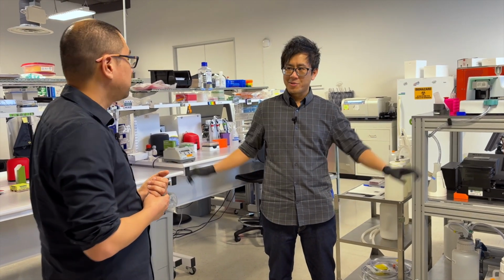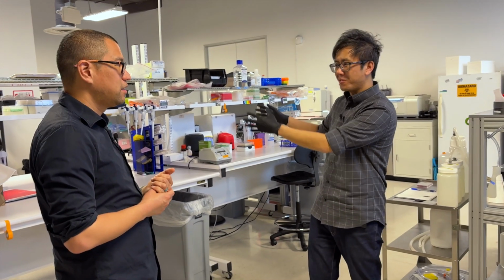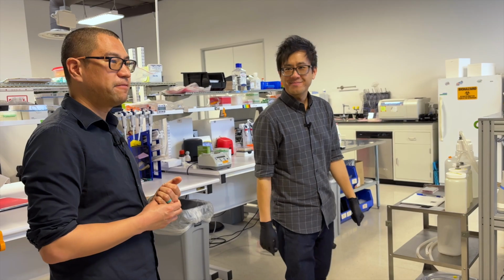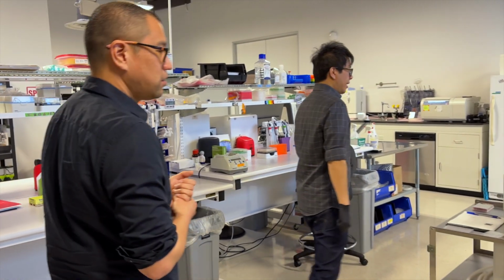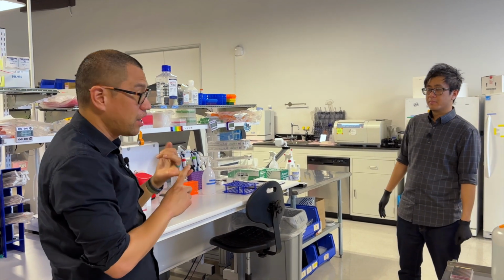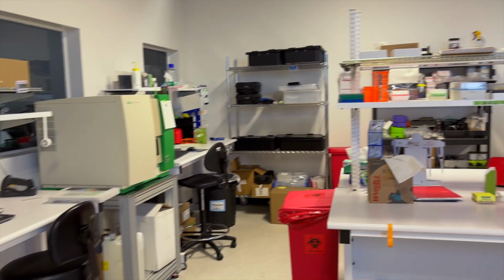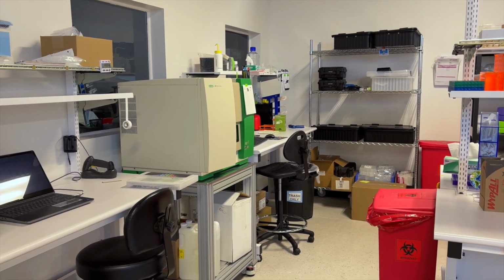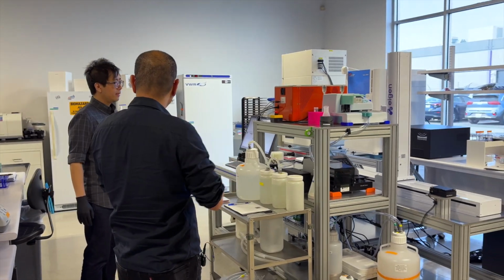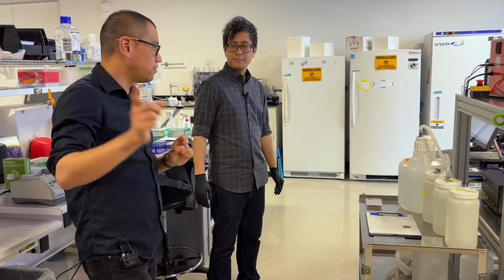Got it, yeah. So that's where you can have little islands of automation. This little automated area does steps 1 through 6. You move it to this other automated area that'll do steps 7 through 10. Makes sense. So just to recap, this island of automation helps you create compound plates, maybe do some staining. This section helps you do readouts. And then this island kind of puts everything together, but does it at high throughput. Handles the core parts of drugging and flow cytometry. Drugging through flow cytometry, yep.